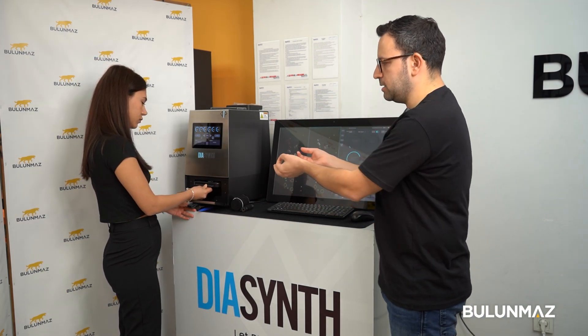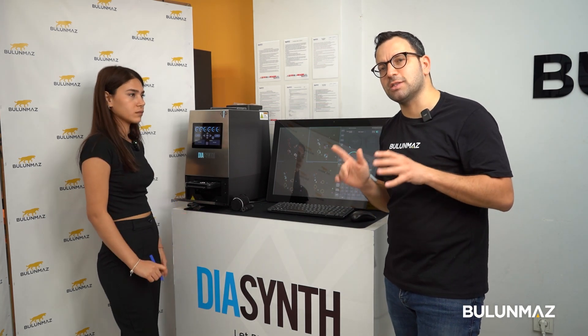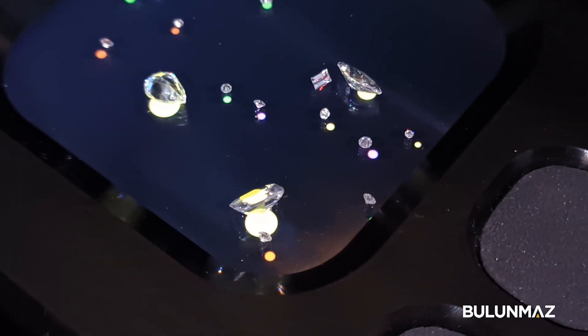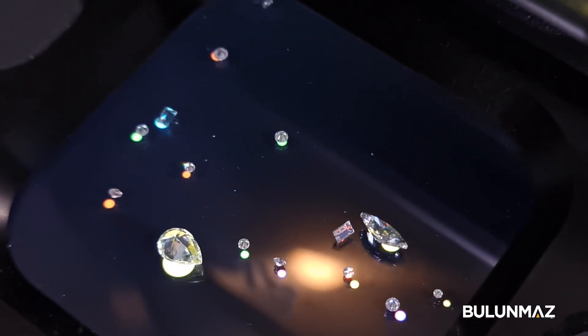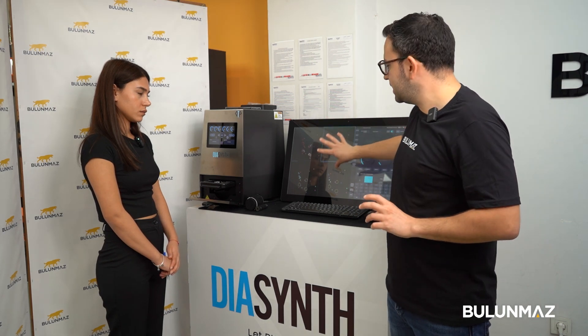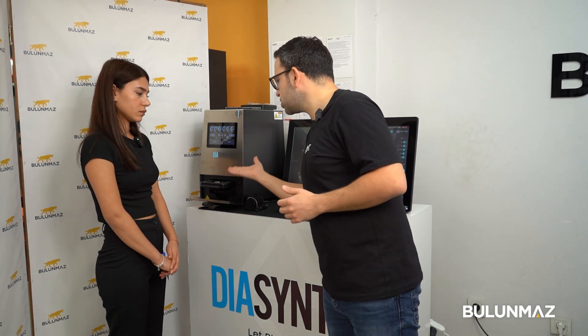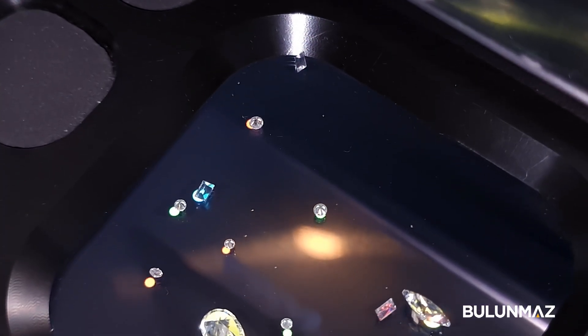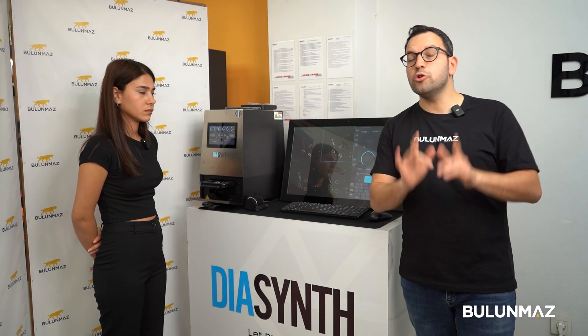Let's get a close look at the tray. We open the cover and slowly pull the tray — and a surprise is waiting for us. When you open the tray you will see an LED screen below the tray — that's a patented technology of DTP company. Exactly the same color and shape of each stone found by the AI test result appears just below the stone itself. That makes it much, much easier than other machines on the market to pick them out and clear your lot.